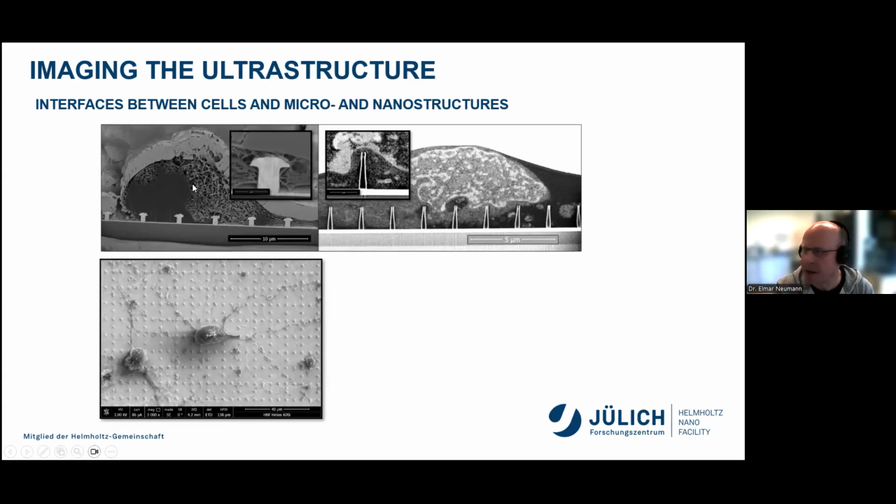This is what it is all about. We would like to end up somewhere here with our investigations, with our efforts. The left one is a cryo sample, and the right one is a resin embedded sample. This one underneath here, the left one is also cryo. And I would like to point out how to get there.